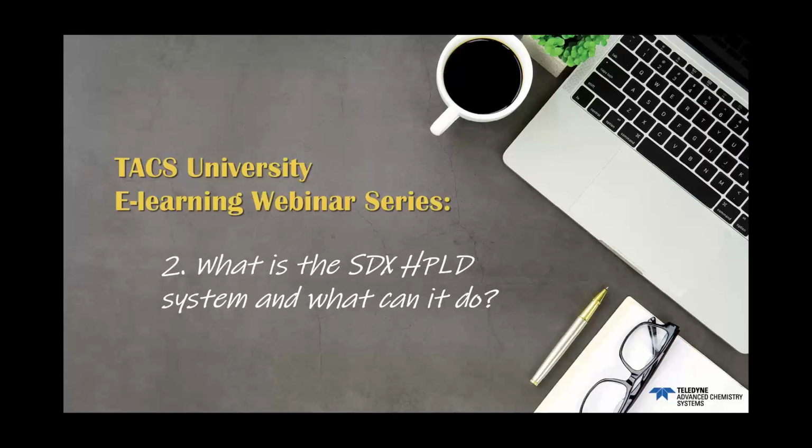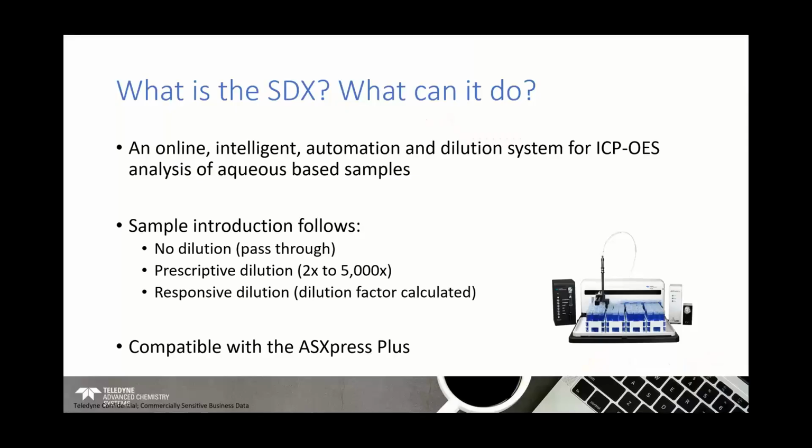So first of all, what is this system and what can it do? The SDX system is an online intelligent automation system for the dilution of samples, calibration standards, etc. for ICP-based instrumentation analysis of aqueous-based, acid-based samples. So that's what it is.